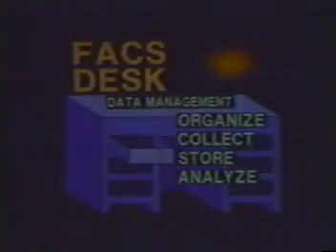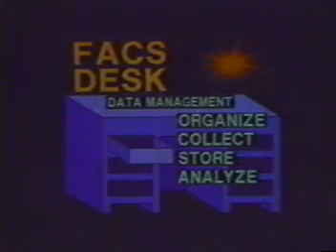This concludes our introduction to FACSDesk. The information presented in this videotape will get you off to a good start in mastering FACSDesk. As you practice using your desk, you'll find that some commands may only be given at certain levels. If you give a command that cannot be carried out, the terminal will emit a beep. Don't let this alarm you. You cannot damage FACSDesk through the keyboard.